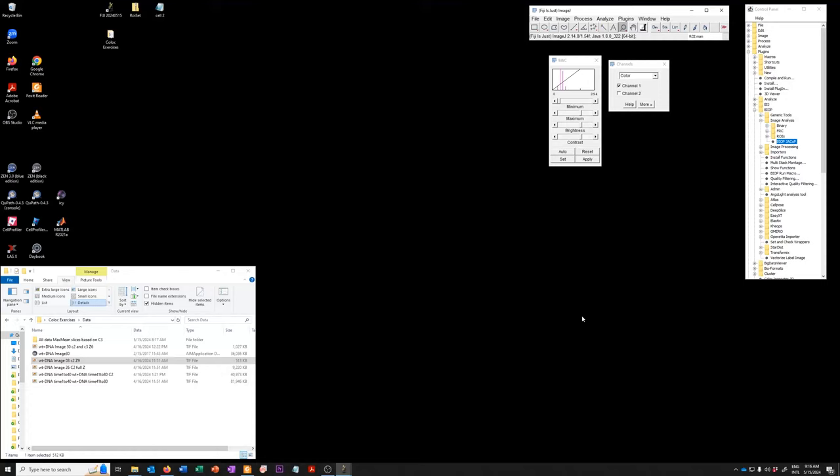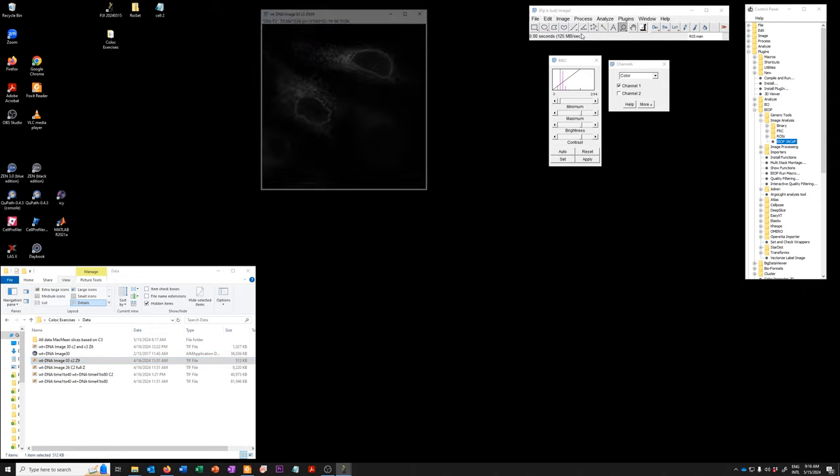We are now going to do exercise number seven using a single image to explore thresholding options. I've already run the cleanup macro so all of the windows from the previous exercise are gone and I'm going to open a new file to use that one to explore for thresholding which is this wild type minus DNA 3 channel 2 z9.